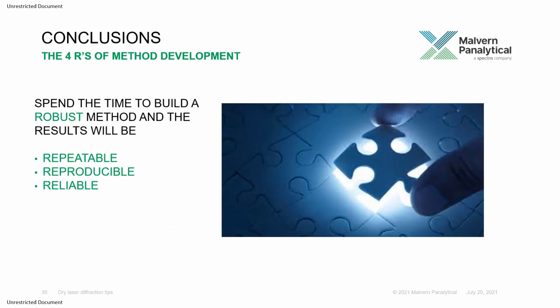In conclusion, spend the time to build a robust method in both wet and dry dispersion, and your sizing results will be repeatable, reproducible, and reliable.